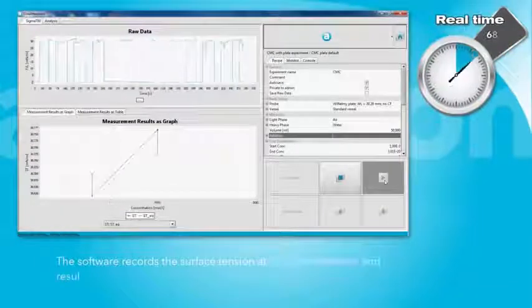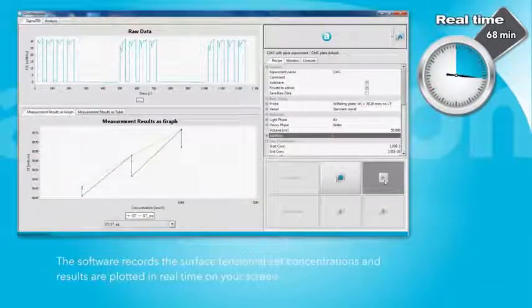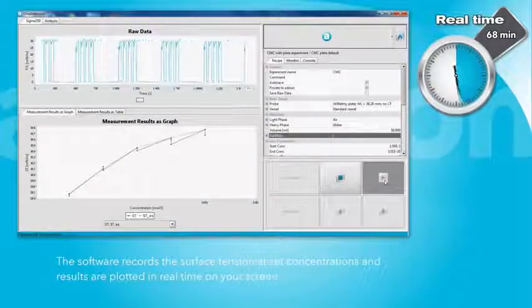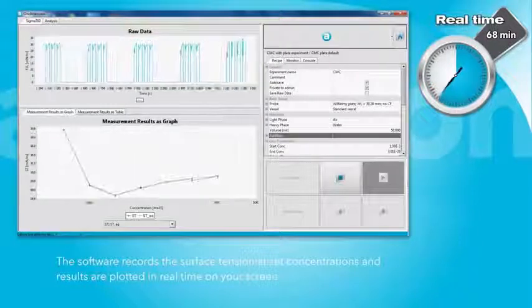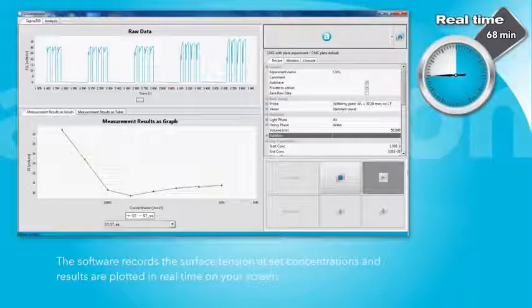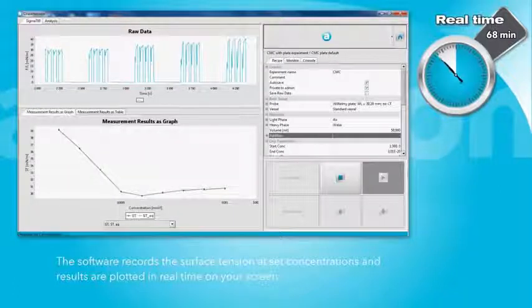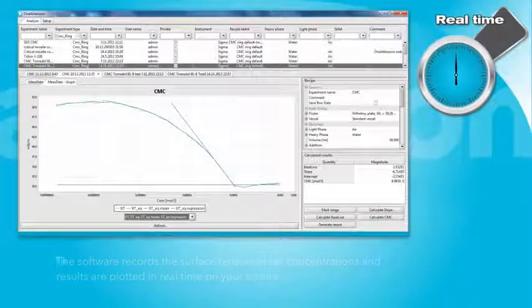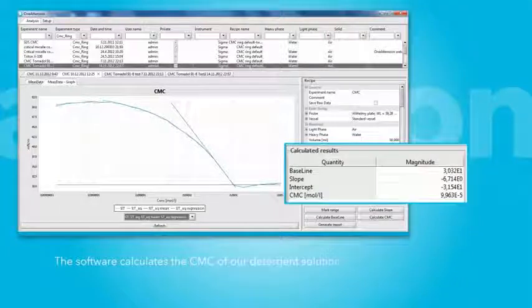The software records the surface tension at set concentrations and results are plotted in real time on the screen. Software calculates the CMC of your detergent solution.